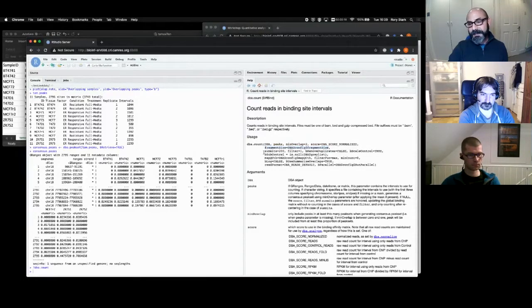And now there's a couple quite interesting ones. These parameters are actually quite important. I mentioned that when we merge peaks or intervals, whatever they are, they end up getting wider and wider and wider. And this causes two problems. One is you end up with a potentially large variance in the size of each interval. And this can actually throw off the analysis.